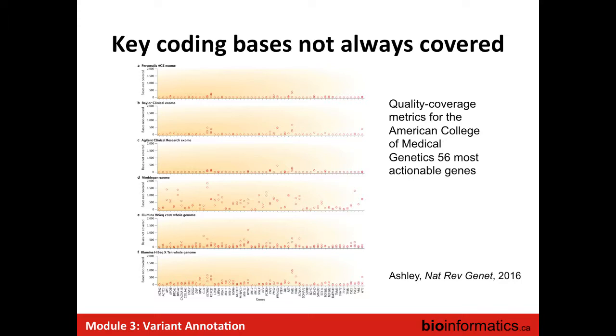So that's one of the challenges if you're using these control cohorts and you have a new assay that's looking into regions that are not covered in the other one. Going back to your question in the back, that's going to be an issue. So it's definitely consistent within assay, but you have dropouts because of the assay and dropouts because of the analysis pipeline that you're using. So you need to match both of those things to really be able to learn.